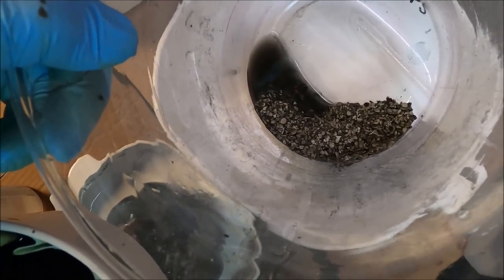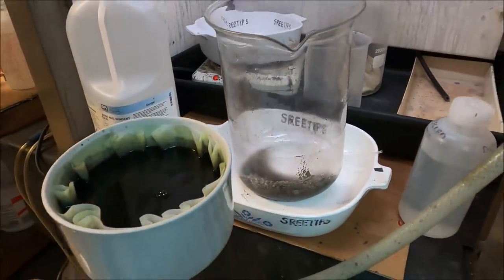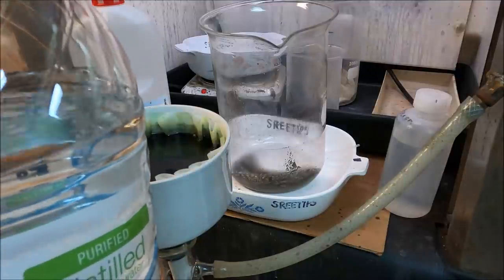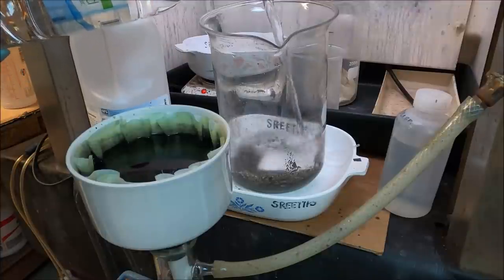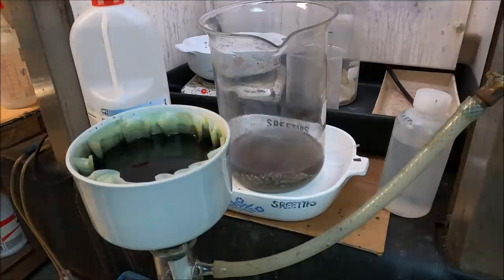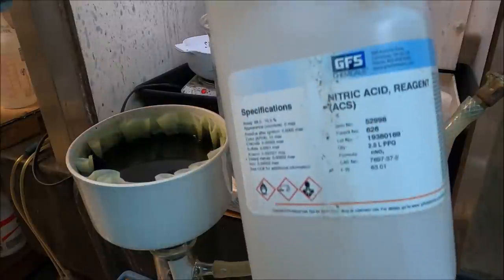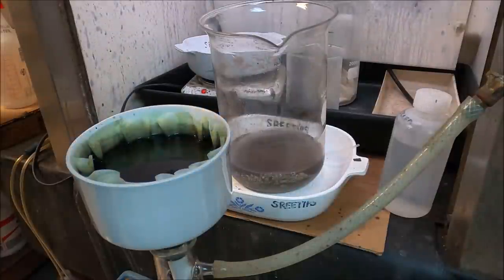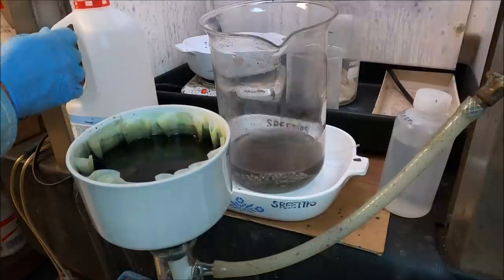And I think the best thing to do here is to dissolve the rest of that. So I'm going to add some distilled water to this beaker. Half a liter or so. And now we're going to add some nitric acid to it. We'll put in about 200 milliliters of nitric acid here. I'm going to set it back up on the heat in the back there. Dissolve the rest of that silver.